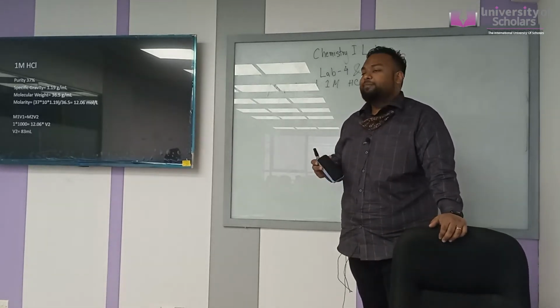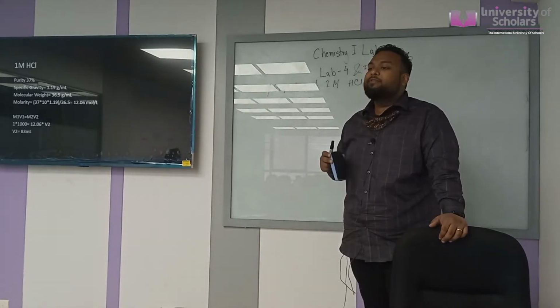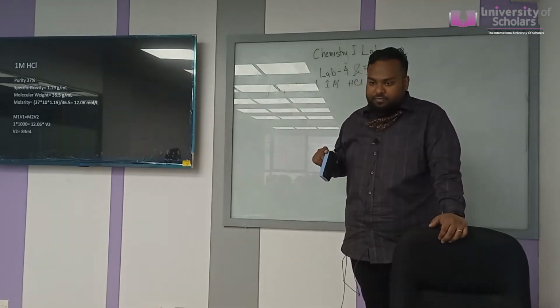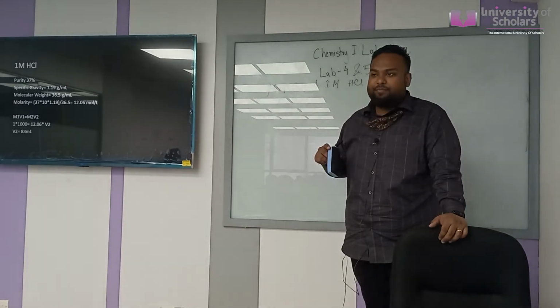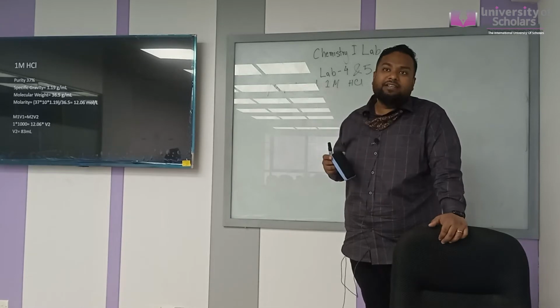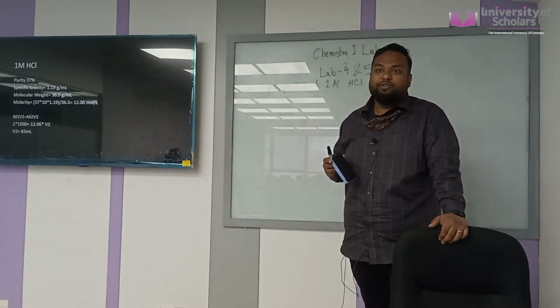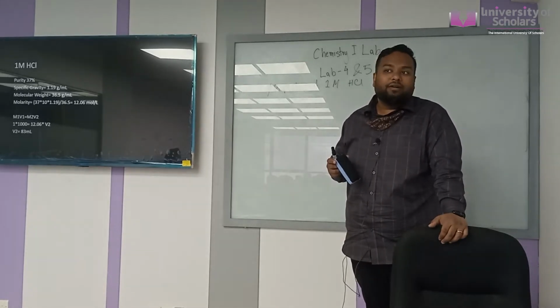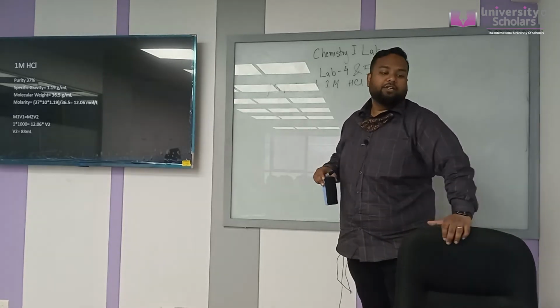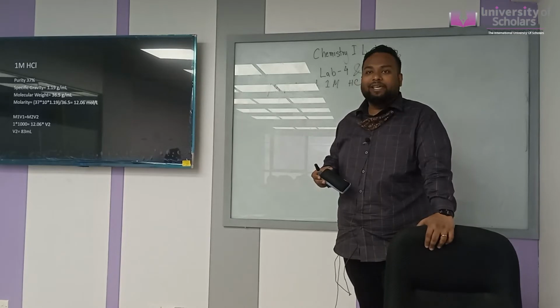Okay. So if you're given some information, which you can see in the slide, say you have to make 37% pure hydrochloric acid, but you have to create a dilute hydrochloric acid, which should be 1 molar, right? What molar? 1 molar. Okay. So few pieces of information will be given.